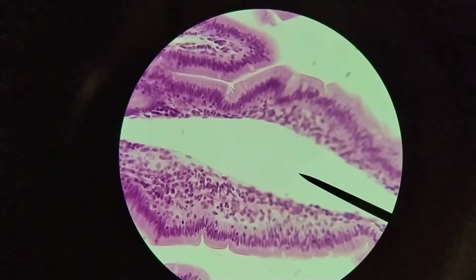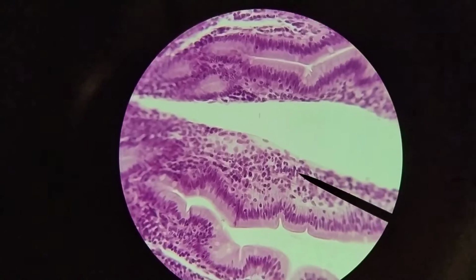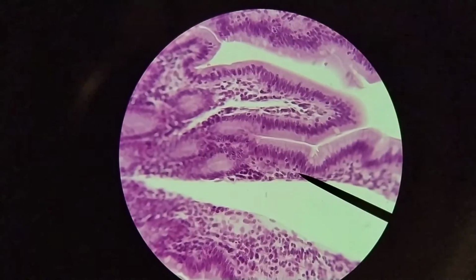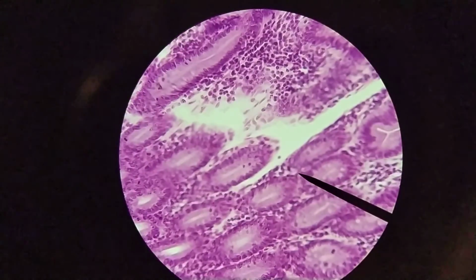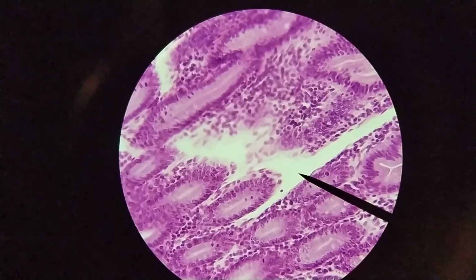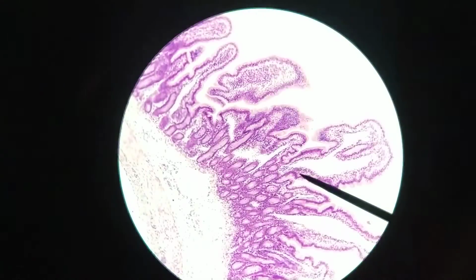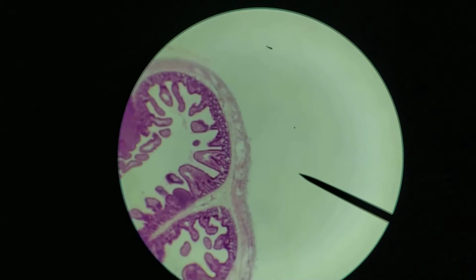Okay, so this is a lacteal, whereas blood vessels are a little bit smaller and a little bit closer to the surface. Okay, so there's another one right here. So there's many of these things inside of each of these villi. Okay, so let's zoom back out and take a look at the last part of the small intestine.